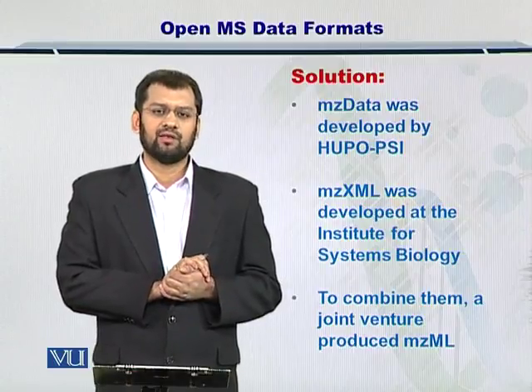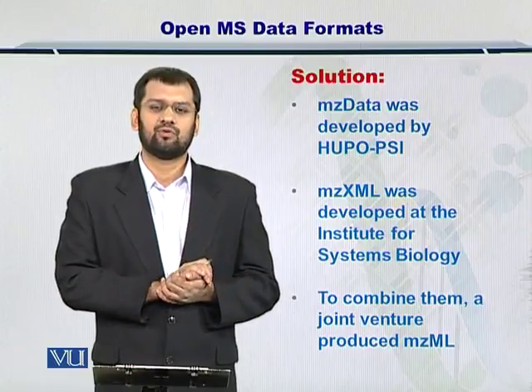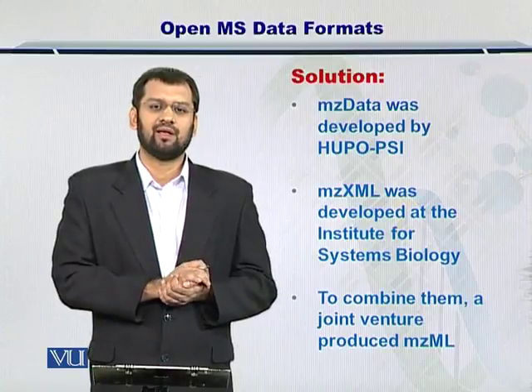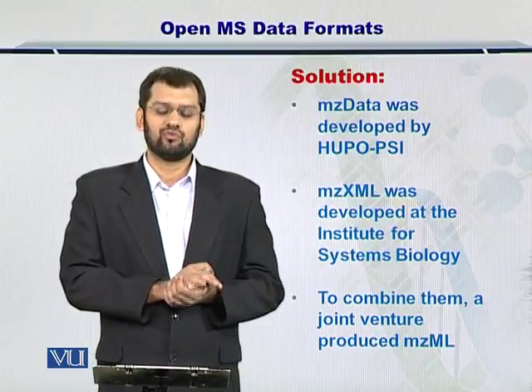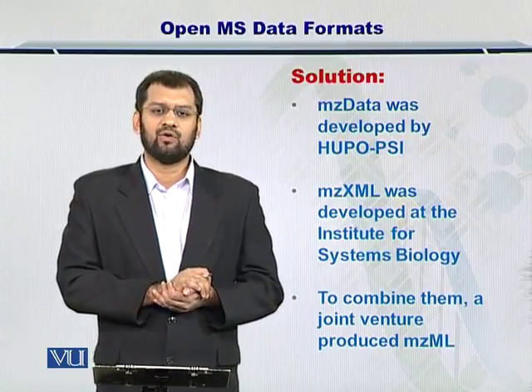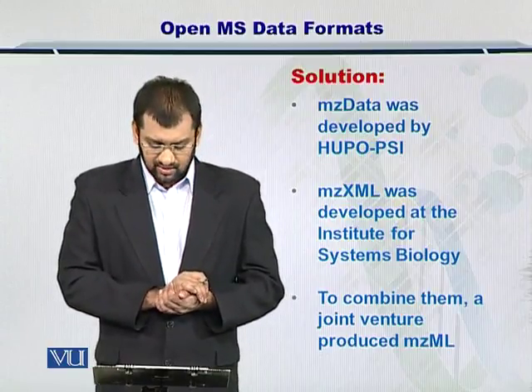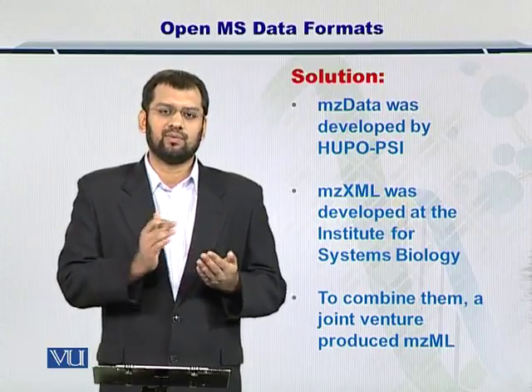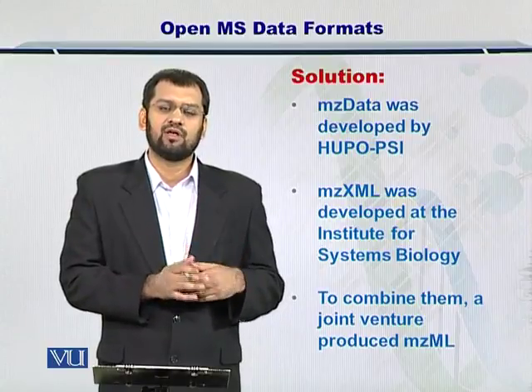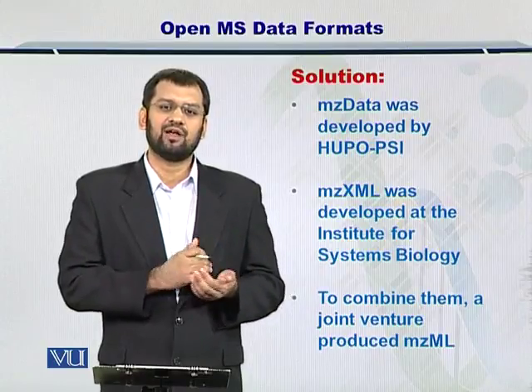The solution that was developed was the open file formats, or the XML-based formats. For instance, MZ-Data, MZ-ML, MZ-XML, and so on and so forth. The MZ-Data file format was developed by HUPO-PSI, that is the Human Proteomics Organization, and the MZ-XML was developed by the Institute of Systems Biology at Seattle, and these file formats continue to grow rapidly because of their openness and because of their accessibility.